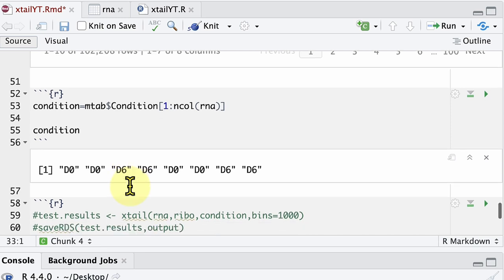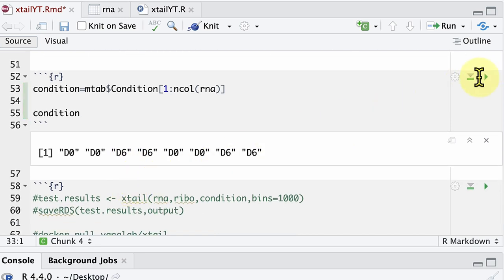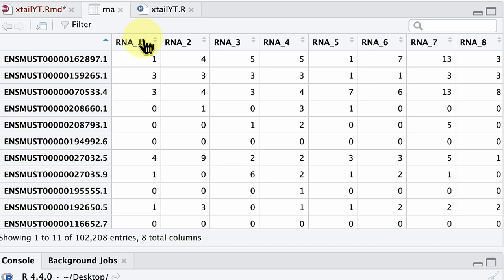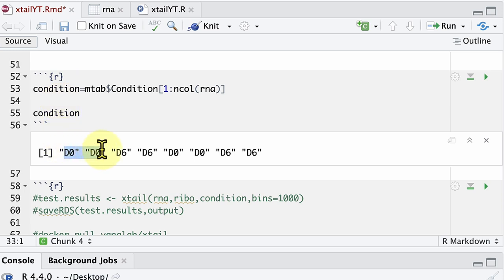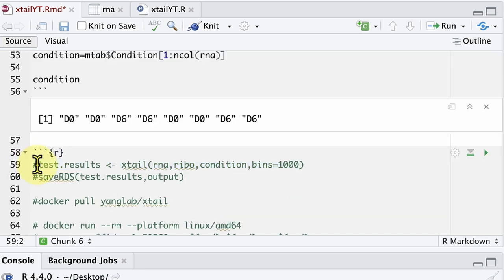The last thing you need to do before loading the data into XTail is to provide a vector telling each sample which condition it belongs to. For the RNA samples one through eight, we say the first two samples belong to condition D0, the second two to D6, the following two to D0, and the final two to D6. This is the command we want to run, but there is a caveat: installing XTail can be a little complicated. There is a simpler way — using a Docker image.